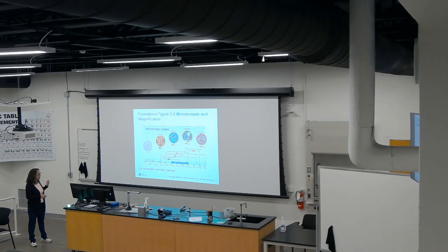So we have our eyes, of course, that can see objects up to something that is 100 micrometers. I mean, if you're young and you have good vision, you can see something up to 100 micrometers. More than likely it will be something greater or equal to 200 micrometers, and we will see the units in a bit. But for instance, we have here the thickness of the skin of a person. If you don't wear lenses, of course, you can see it without lenses.